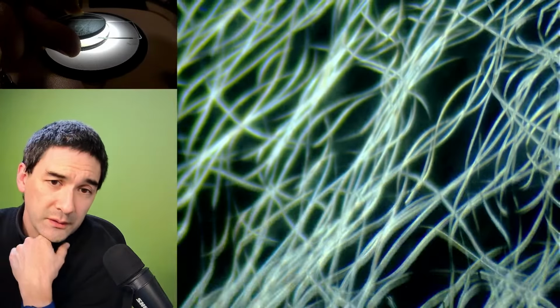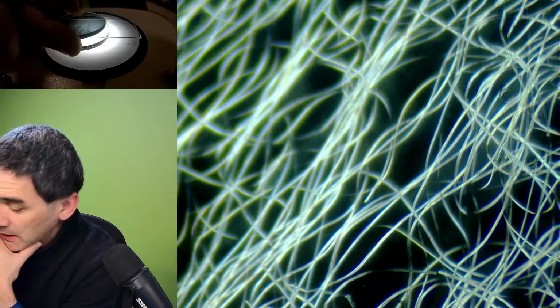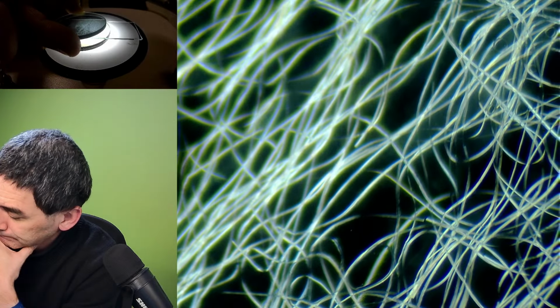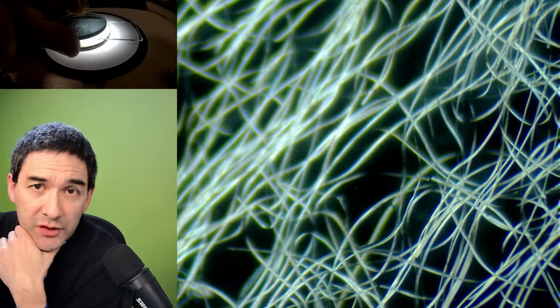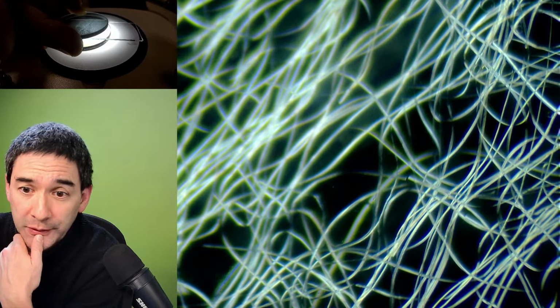Okay, so I would like to simply try the following. I'm going to just use normal cotton, and let's try the soldering iron test, which I have to tell you, I did not try on cotton.